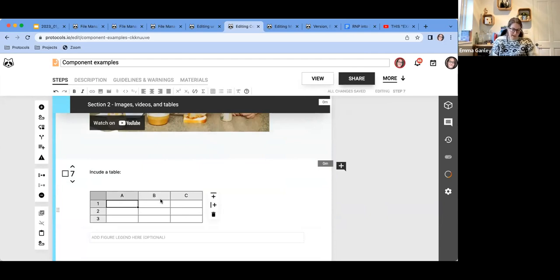So maybe we're back at number of cells, and we'll say we've got 5 and 3, value B, we've got 7 and 4, and here we can just do a very, very simple Excel formula equivalent like this, and it will work very much the same way as Excel.